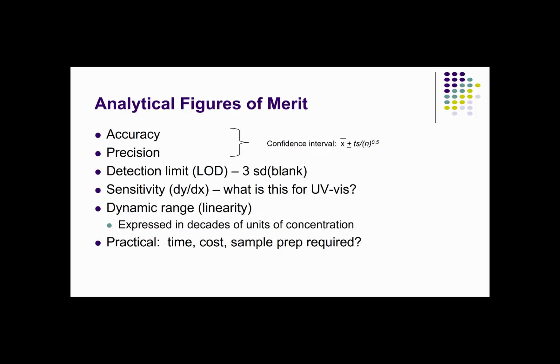So for some purposes, you may need to know your answers more accurately and precisely than for others, depending on the question. It may also be important, depending on your question, how low you're able to go and detect your analyte of interest. And this is the concept behind detection limit, or LOD, limit of detection. As I've written here on the slide, it's basically 3 times the standard deviation for a blank sample. And the blank sample, of course, in principle, should not be showing a signal, because there really should not be any analyte in your standard sample that you're using for this curve.